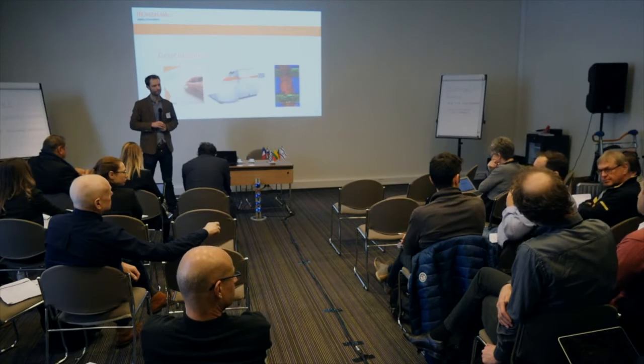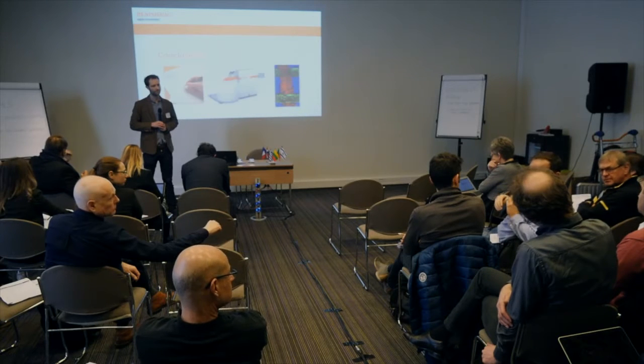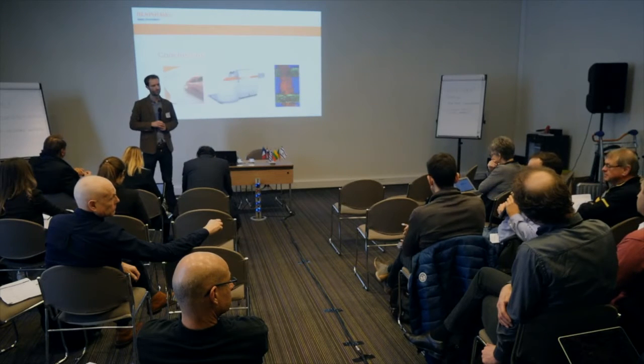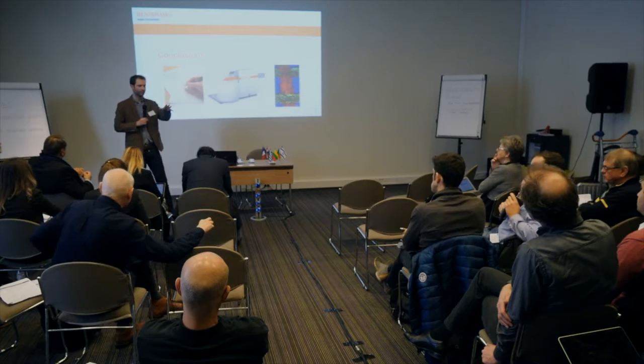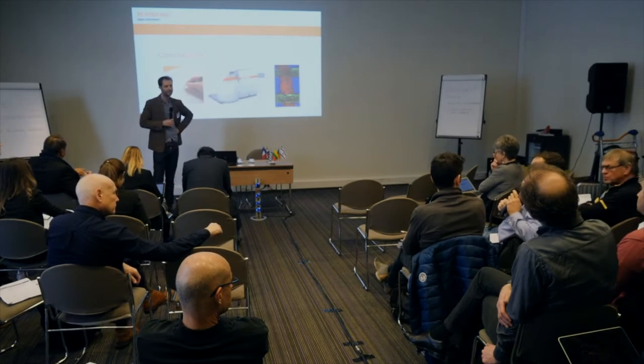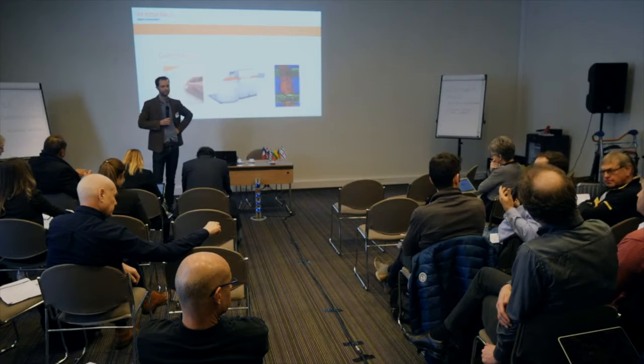So for me, the goal is, as you said, a 20 years old system is able to do that with such a repositioning faculty. So as long as you can see it in the field of view, you don't have to move around. Yeah, if you use 10x objectives, it's easy to get the field of view, and if you have a 5 microns error, you are still in the same field of view, so it's really easy because your particle is singular.